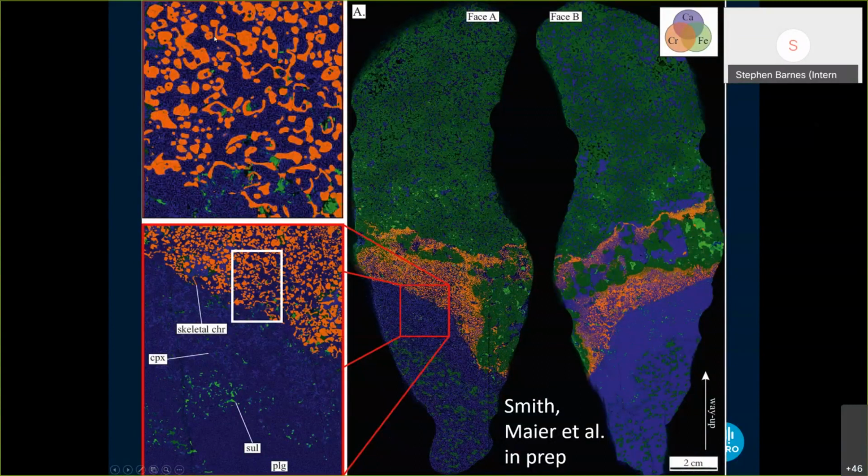But one of the interesting things, these are chromite grains down at the bottom here, and you can see they've got these really characteristically strange kind of wormy shapes. You can have all sorts of fun spotting animal shapes in these chromites. But we know because we've actually done some EBSD on these rocks a few years ago, Zoya Rachmanovich, former student of mine, these things actually turn out to be single crystals. So all of these big wormy things are just crystallographic individual single crystals of spinel.